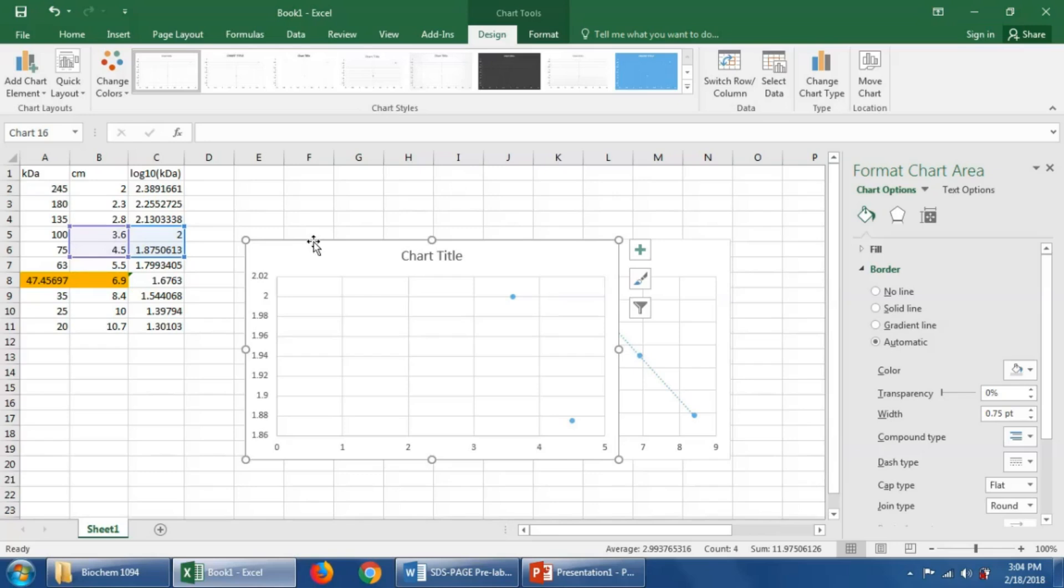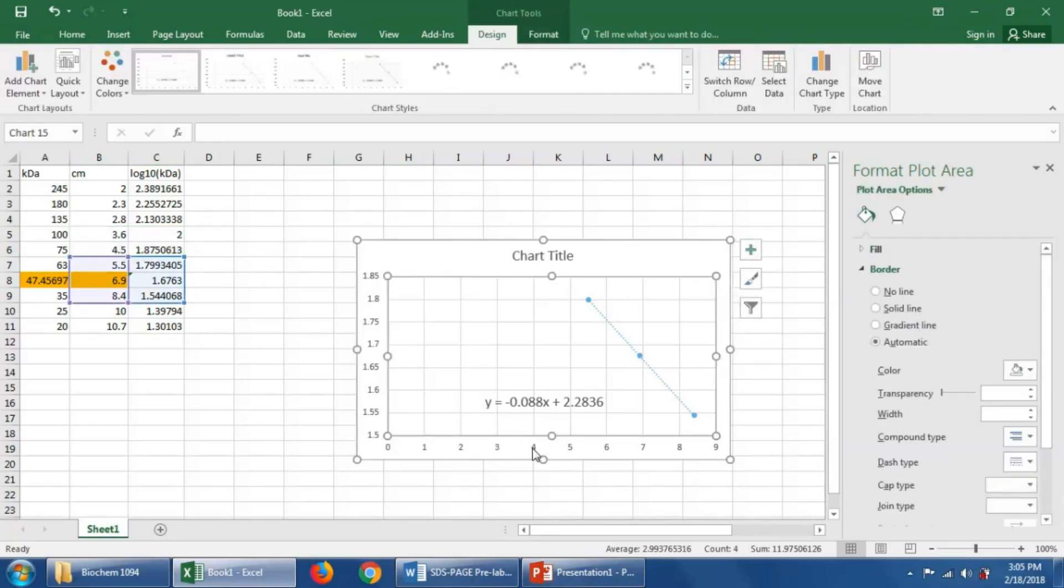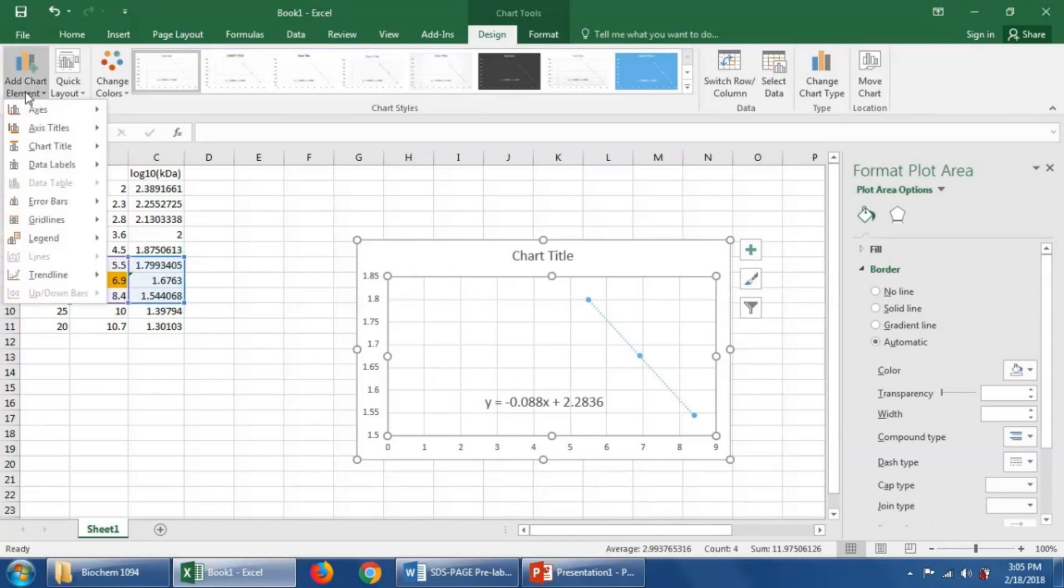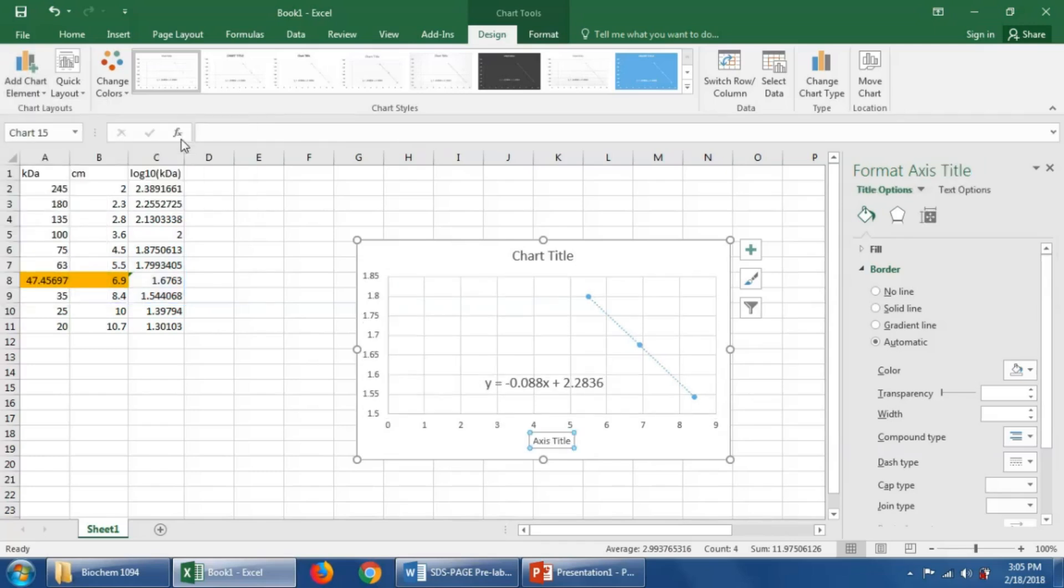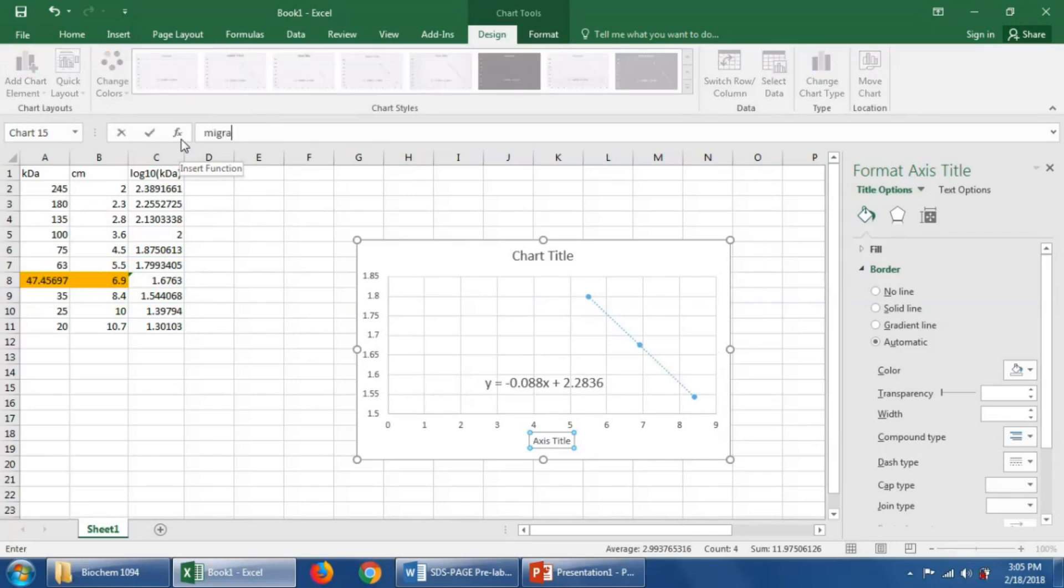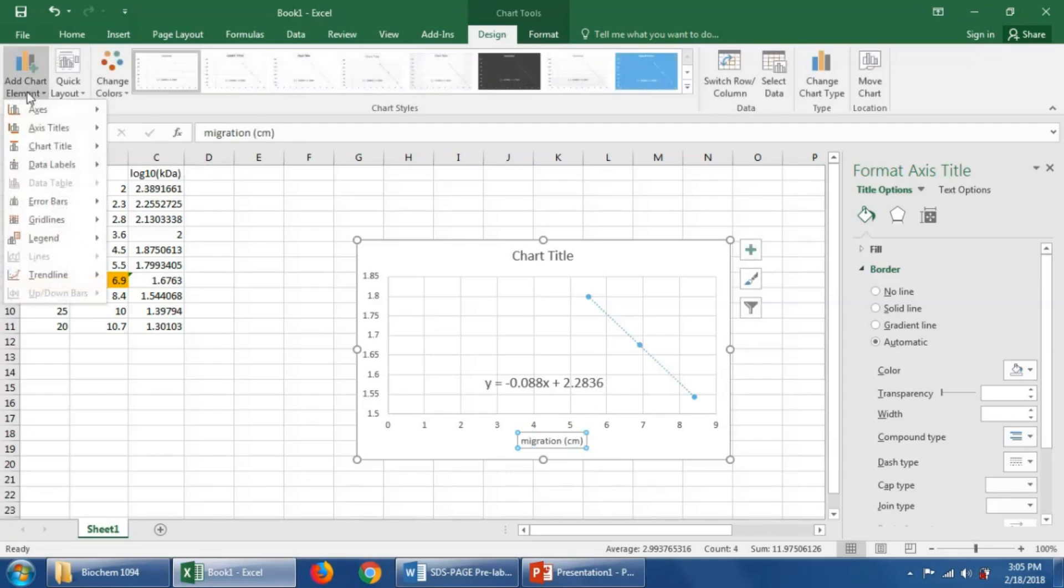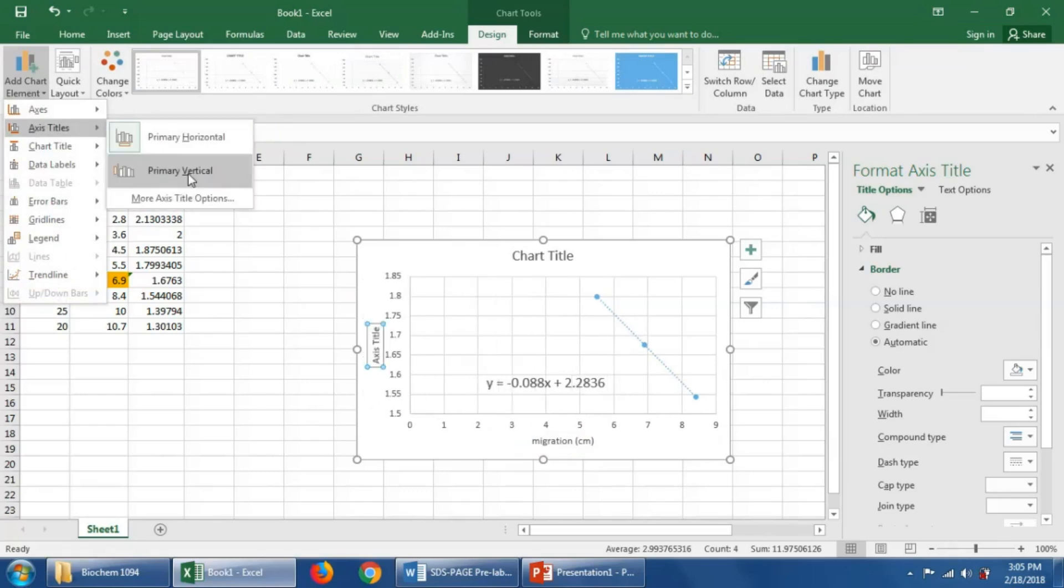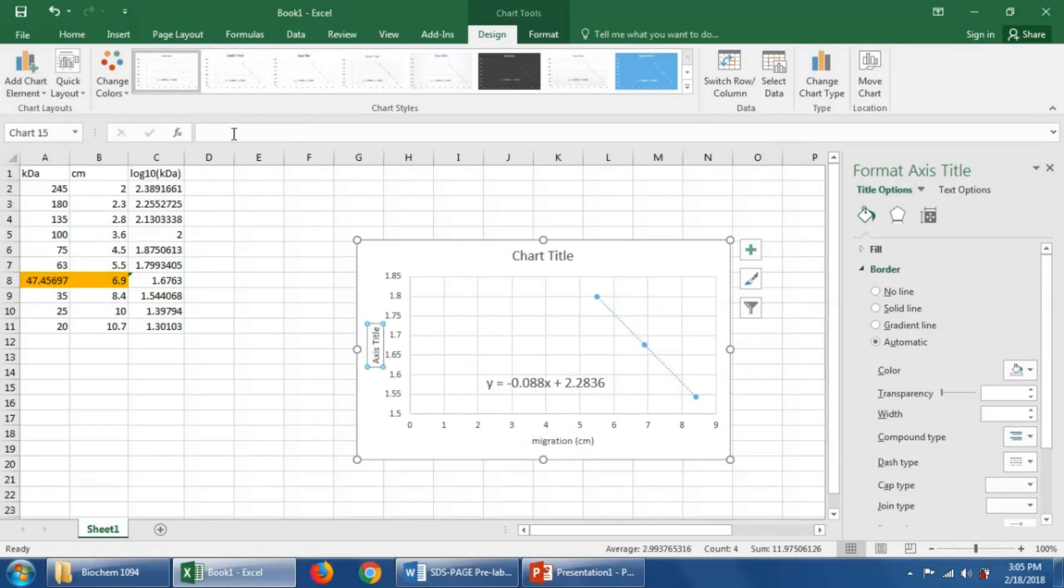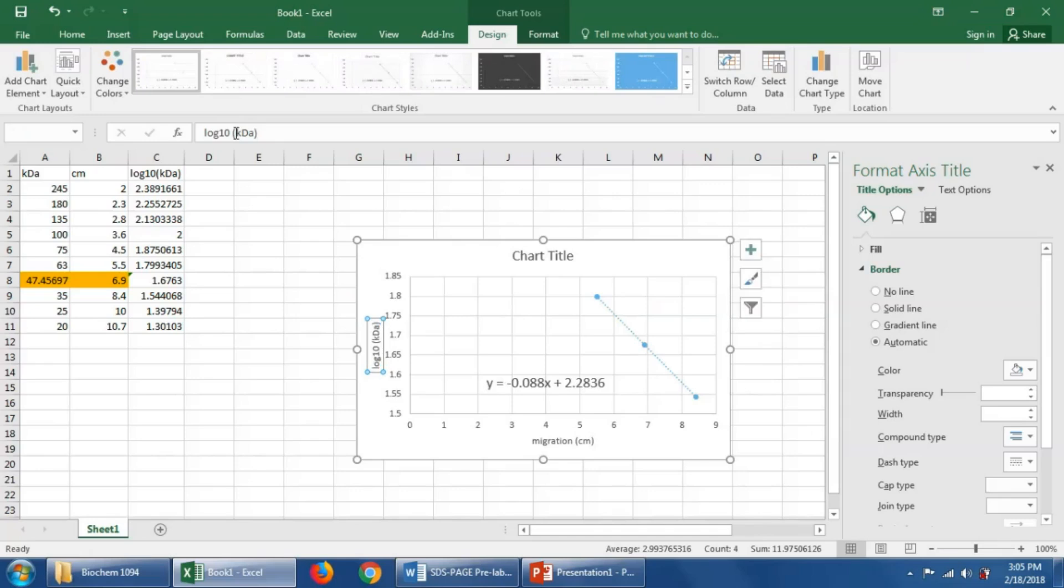One last thing that I'm going to show you that we should have done earlier is we should have labeled the axes. That's important to keep things straight. So we can go to add chart element and we'll put axis title and put horizontal. And we want to put migration in centimeters. And we'll add another axis title. Now this graph is more complete.